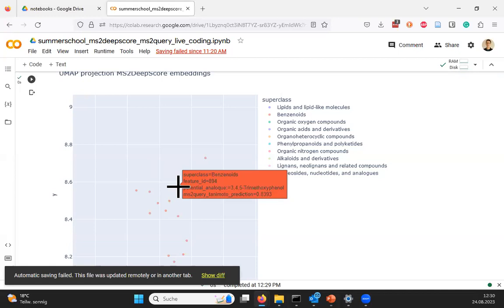So the closest match in GNPS is this compound, that I have no idea what it is, with this predicted Tanimoto score. This Tanimoto score tells you at least it's not super certain, it could be quite a bit away from this, but chances are at least decently high that it has some relationship with this compound. And it makes sense to look into this.